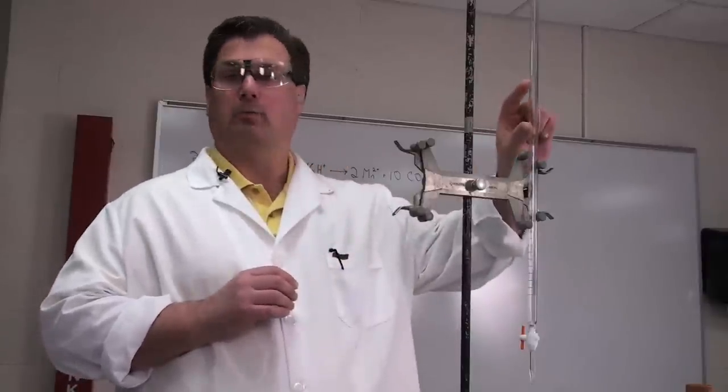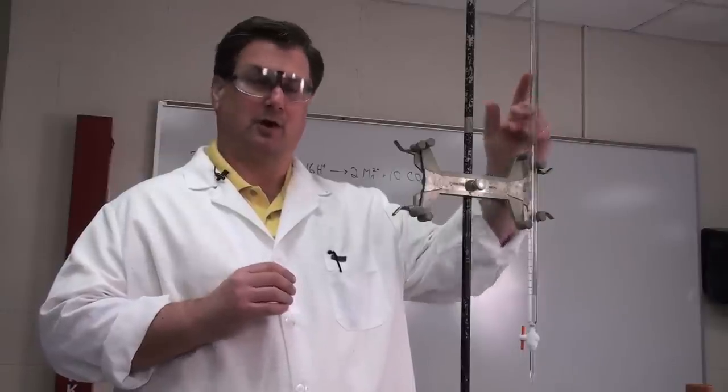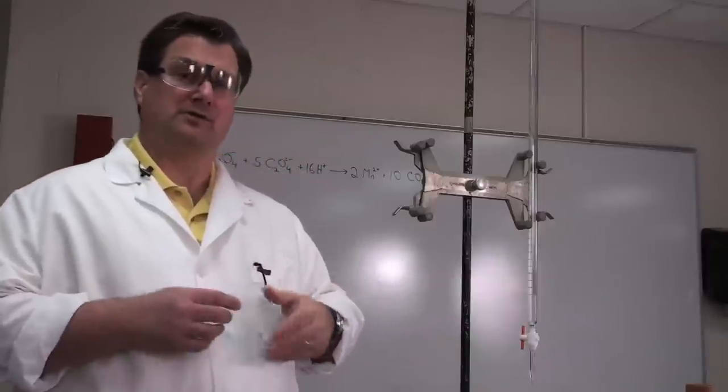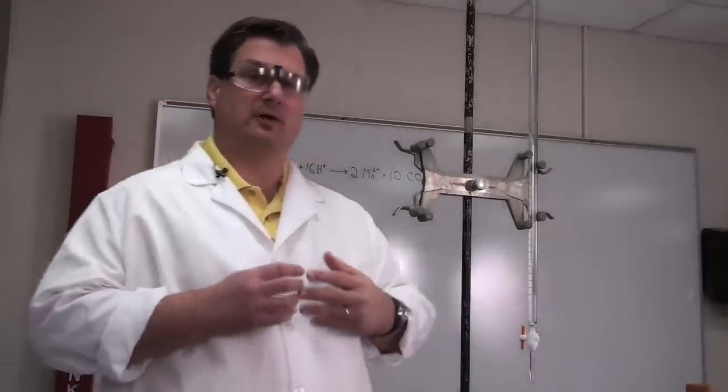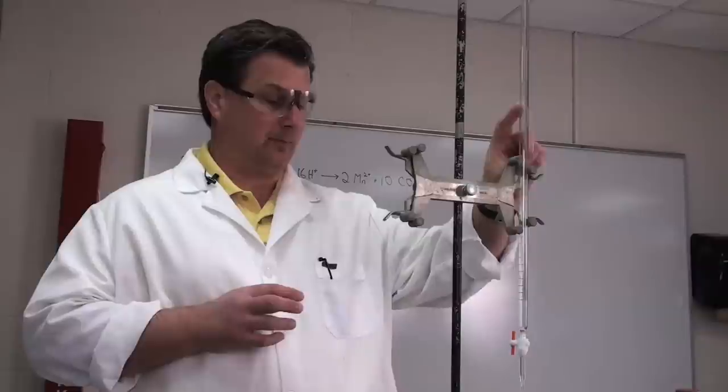In the burette we'll put an unknown permanganate solution. We know approximately what the concentration is, but our goal is to determine that concentration much more precisely. Also, because the permanganate solution is purple, we already have a built-in indicator.